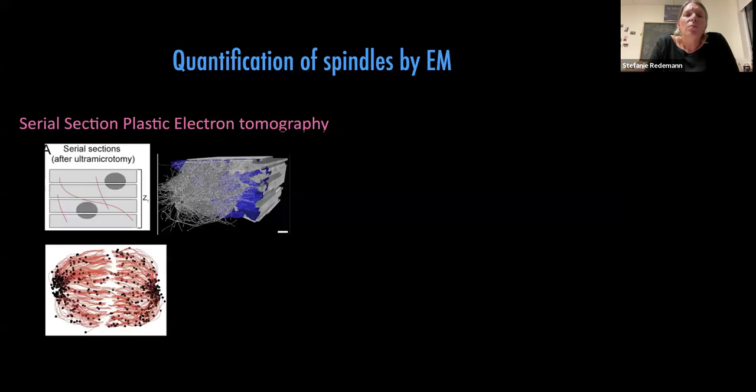So in order to learn more about these microtubules, we decided that maybe we needed yet a better resolution and maybe more insight to understand what those microtubules could be. I think our initial hope was that we could maybe see some motor proteins or anything connecting to these microtubules. And so we decided to move away from serial section plastic microscopy and try cryo-electron microscopy.